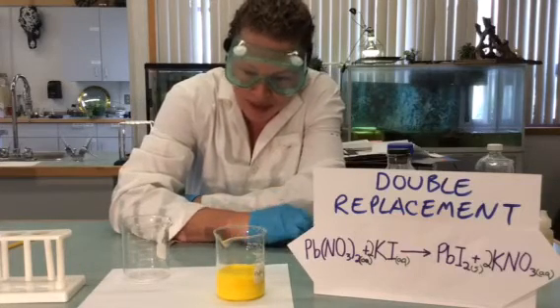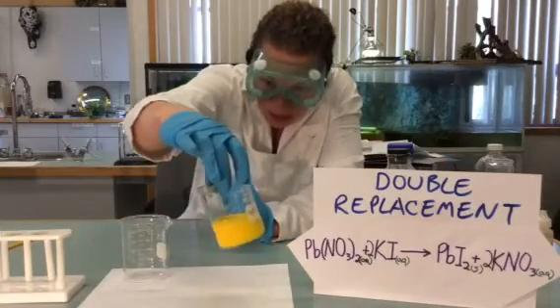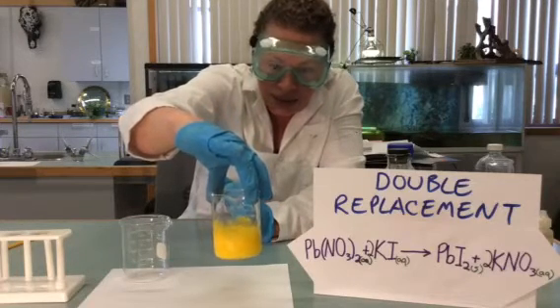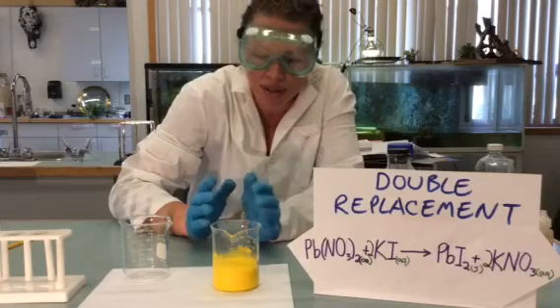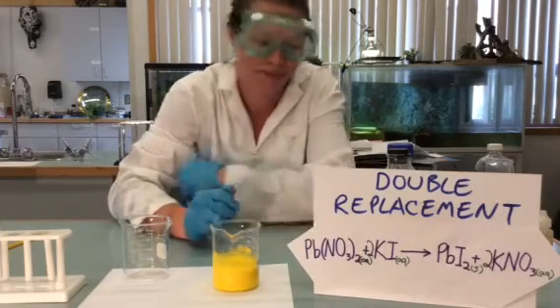We'll leave that for now and come back to it a little bit later, but you can clearly see on the edges that we have a solid here. It's just in powder form because it just formed, and it's all atom to atom connecting right now, so very tiny little bits and pieces.